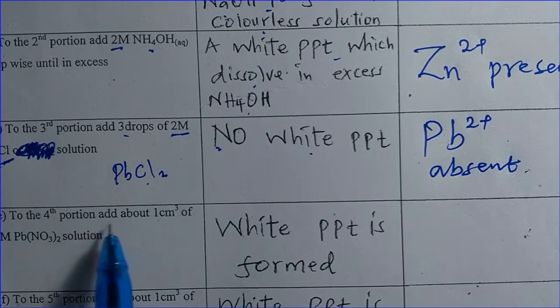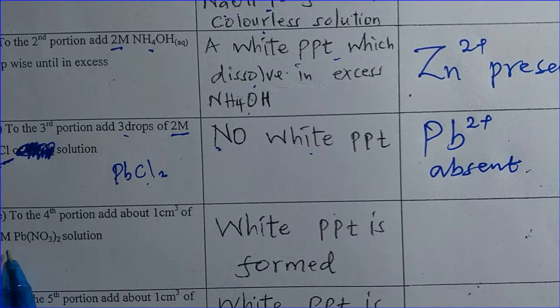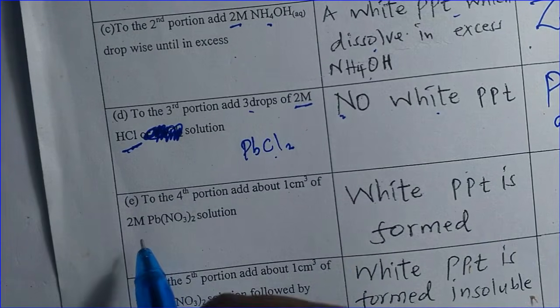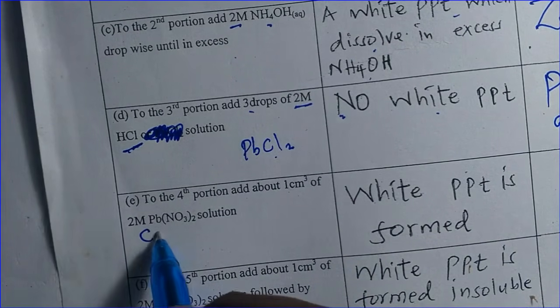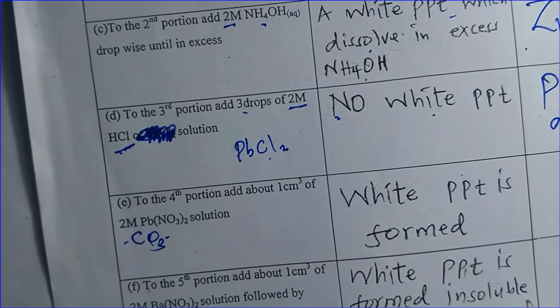To the fourth portion, add about 1 centimeter cube of 2 molar lead nitrate. A white precipitate is formed. So lead forms a white precipitate with the carbonate, so that we have lead carbonate, because we know all carbonates are insoluble white precipitates except those of potassium, sodium, and ammonium.